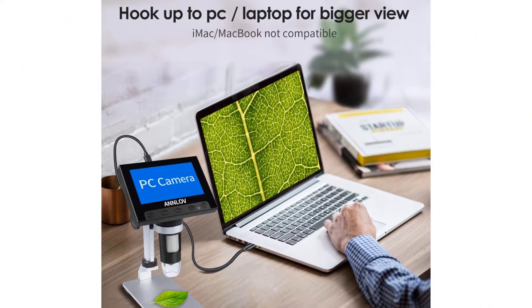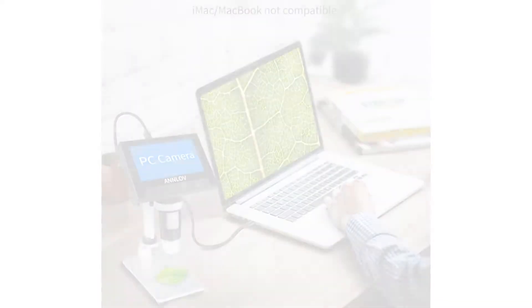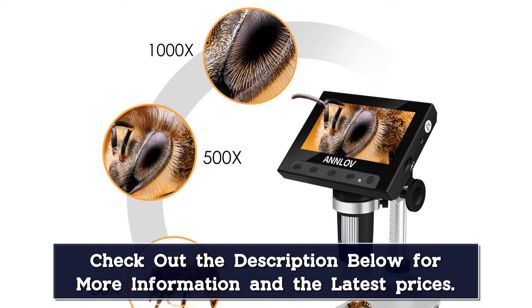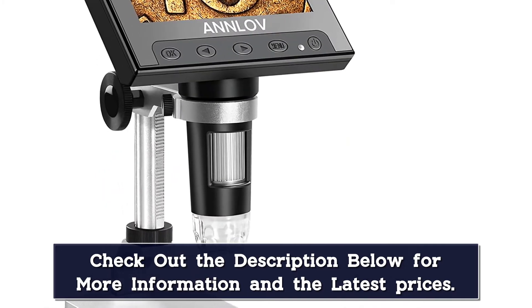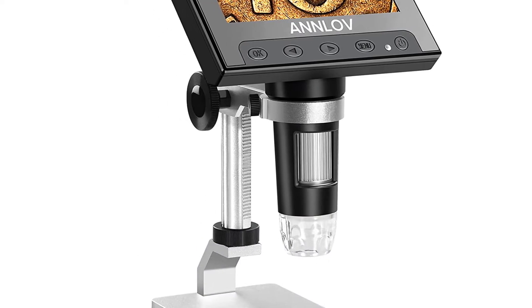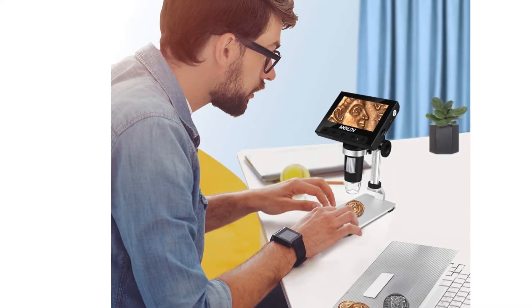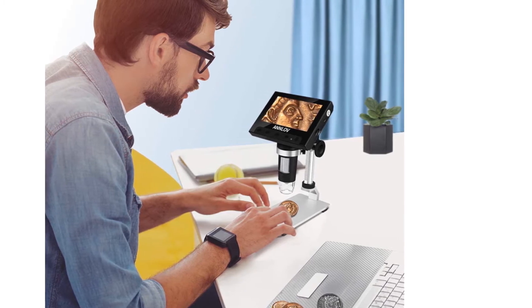It can be a great gift for kids and students and they will love it. Images and videos captured during observations can be saved to a micro SD card, though the micro SD card is not included. The slot supports a maximum 32GB SD card. It is easy to focus and specimens can be seen clearly on the 4.3-inch screen. The ANN-LOV USB Microscope Camera supports PC connection through USB cable and provides built-in 8 adjustable LED lights to adjust brightness from dark to light.